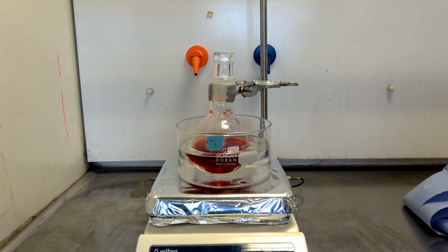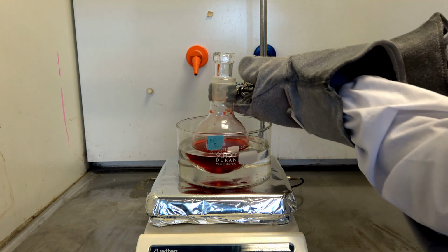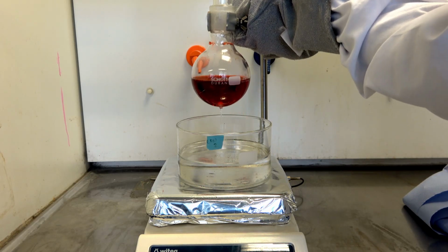When the heating reaction is completed, wear heat protective gloves while handling the flask and the oil bath. Never touch them with bare hands. Lift the flask up from the oil and carefully wipe all the oil off with a tissue to avoid any spills.